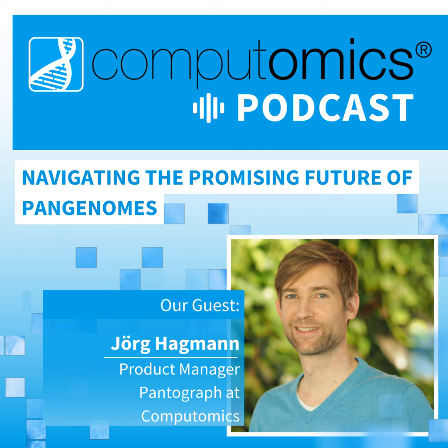That's amazing. So if you had to put it in one sentence, what does Pantograph visualize? So Pantograph is based on a data structure called a pangenome graph, which is basically a compressed version of all the DNA sequences of all the whole genome assemblies, actually, right? Because a pangenome graph is basically, if I may use an analogy, of course.